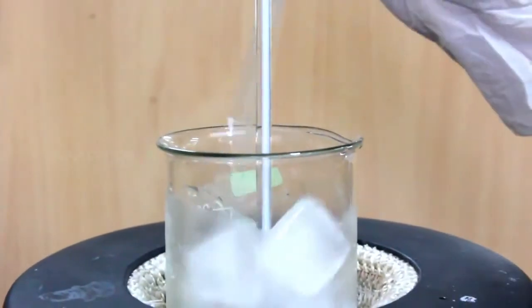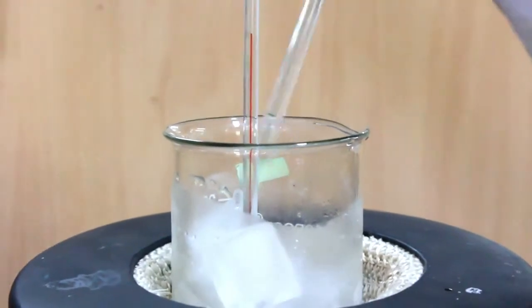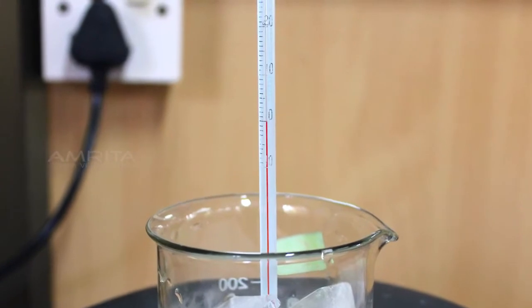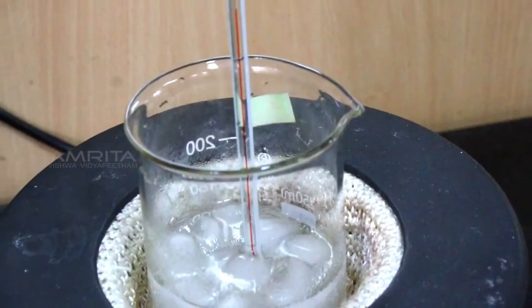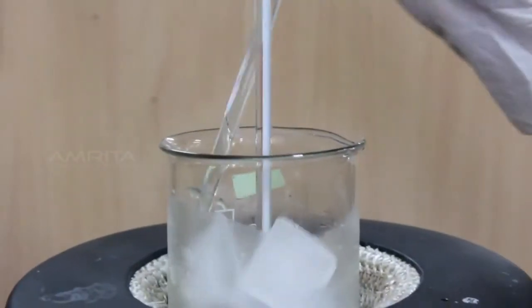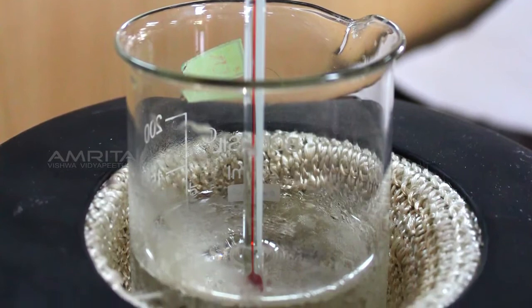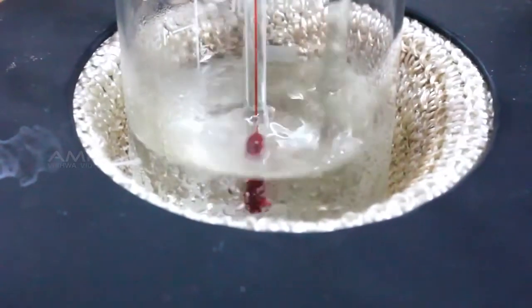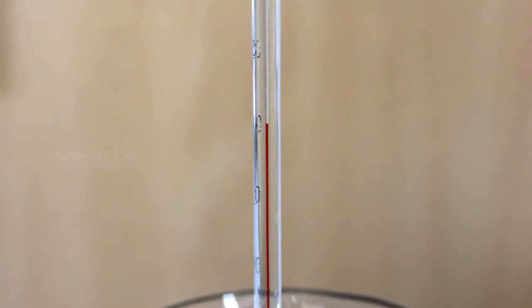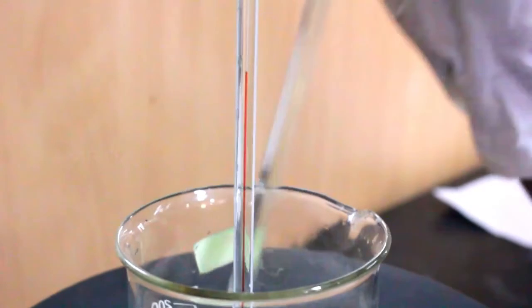Now, stir the ice cubes continuously using a glass rod and note the initial temperature T1, that is at 0 degrees Celsius, when the ice starts melting. Continue the process of heating and stirring the ice cubes till the ice completely melts and converts to water. Again, note the temperature T2 when the ice has melted completely.